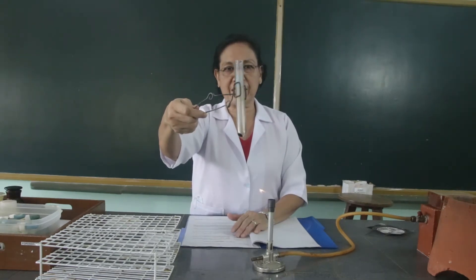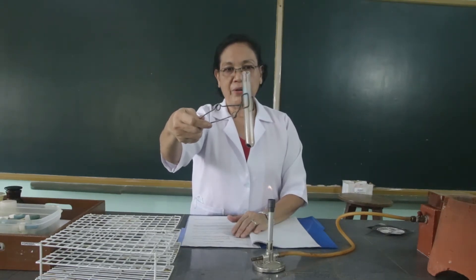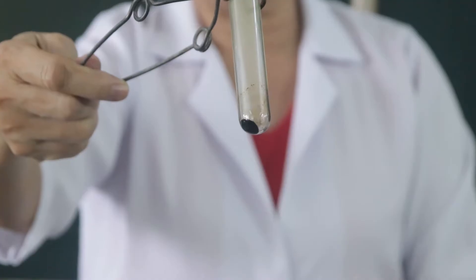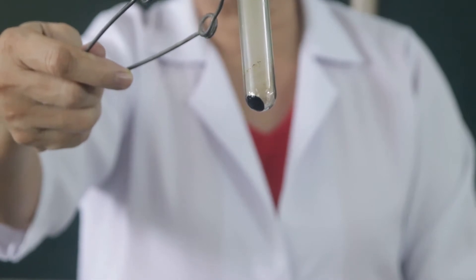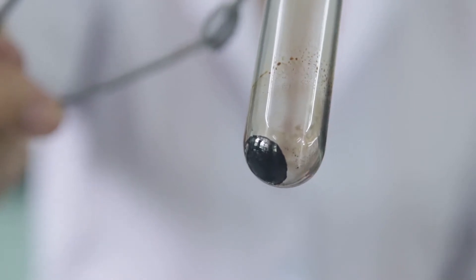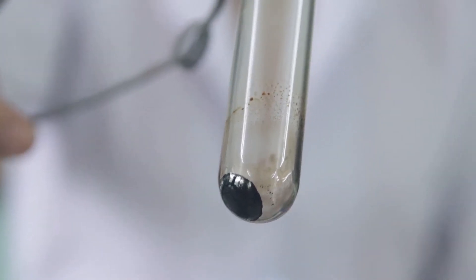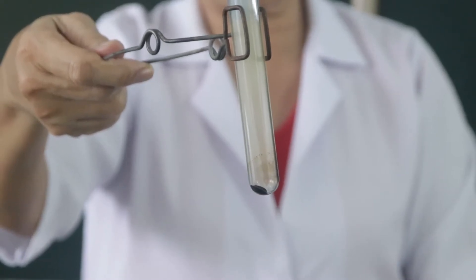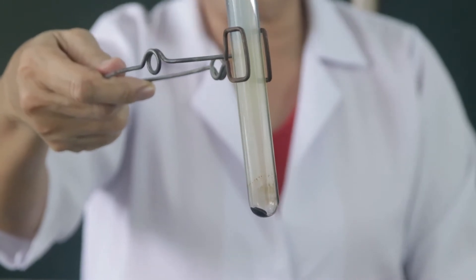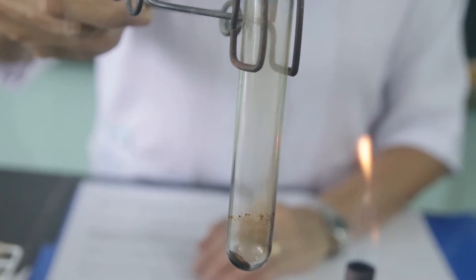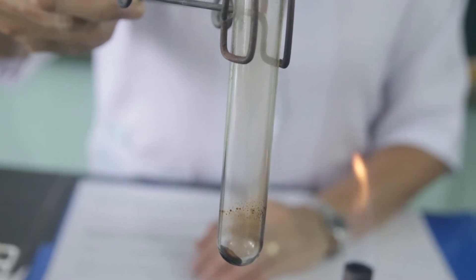I want you to look at what happens to the casein at the bottom of the test tube, and then what happens to the color. A while ago, the color of the casein was lighter yellow. And this time, after heating, what is the color of the casein? Notice also the gas that is emitted or issued out by the casein. Look at the test tube containing the gas. What gas is this?